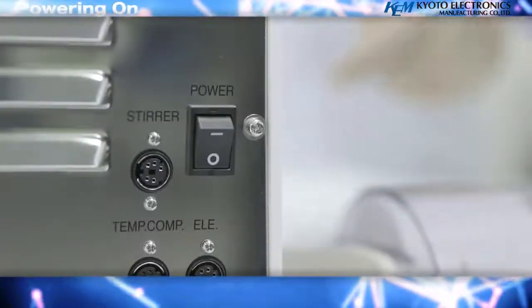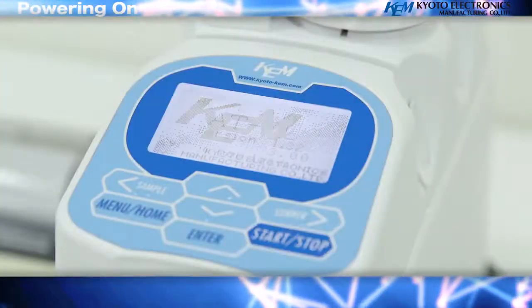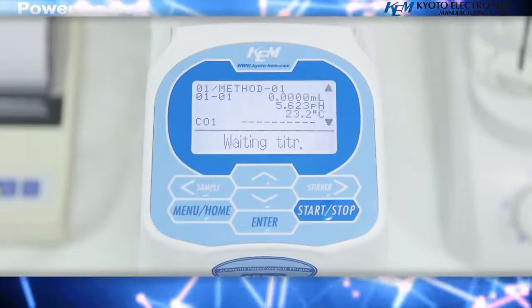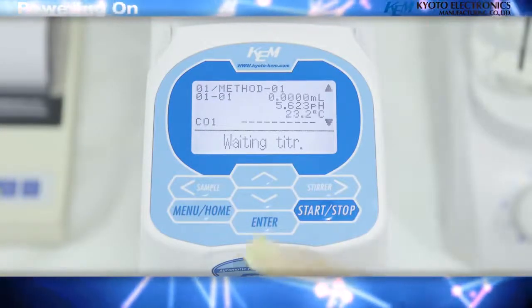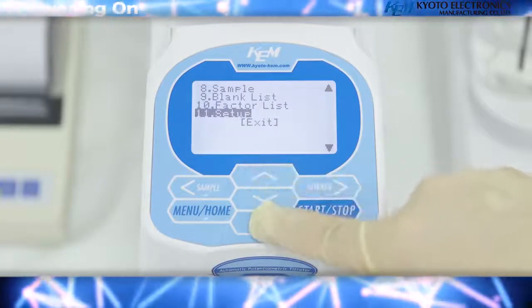Powering on: first, turn on the power to the measurement unit. Then press the Menu/Home key. Select the 11th menu option, Setup, and press Enter.